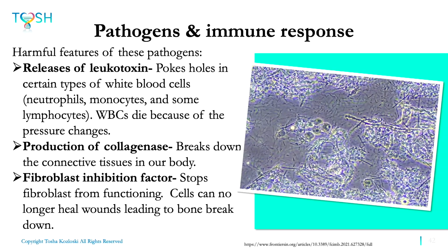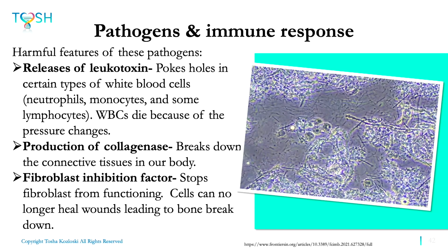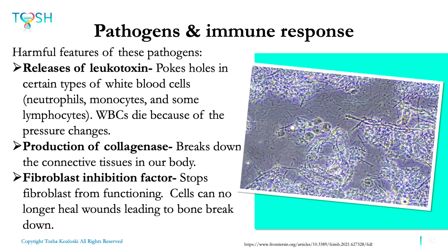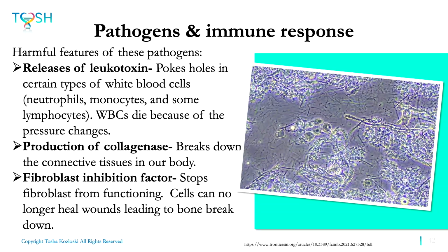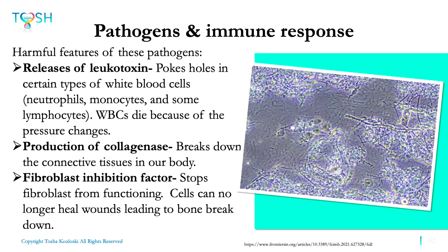This slide over here has lots of cool stuff in there. So we've got some corn cob effect here. We've got an amoeba over here. We've got some white blood cells. That person kind of had all kinds of infection. I think this person was in their 20s.